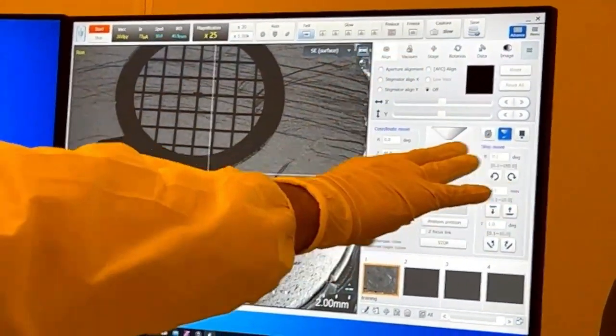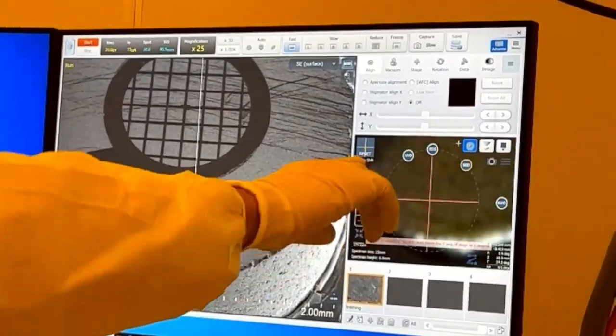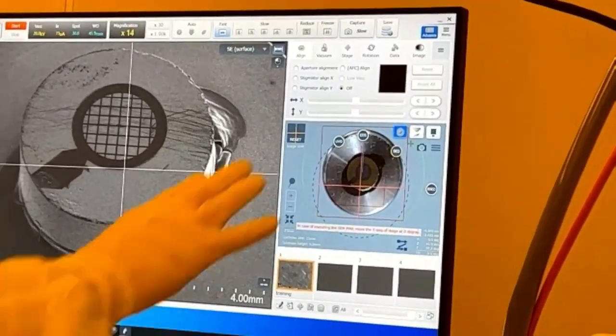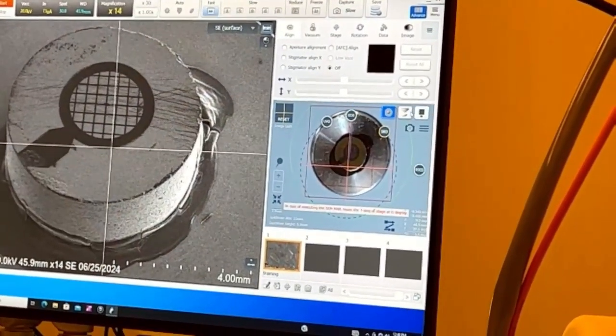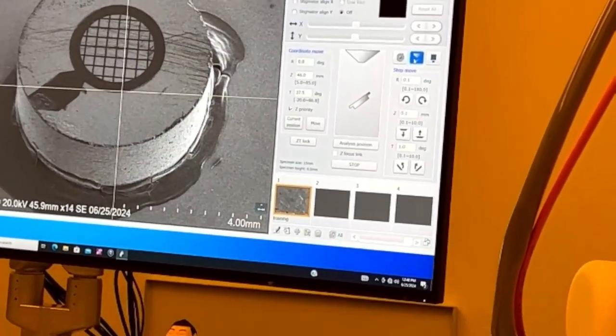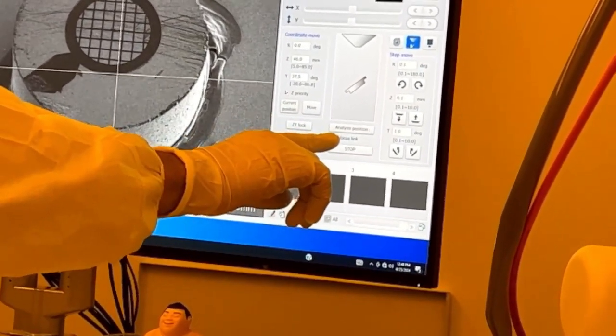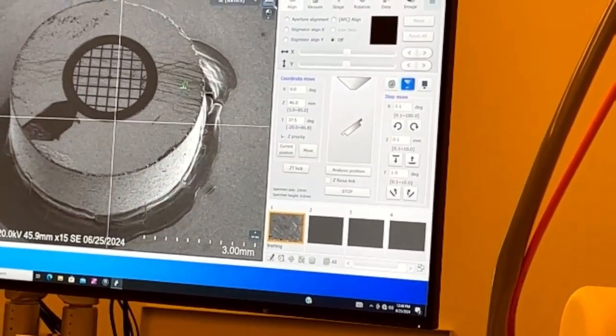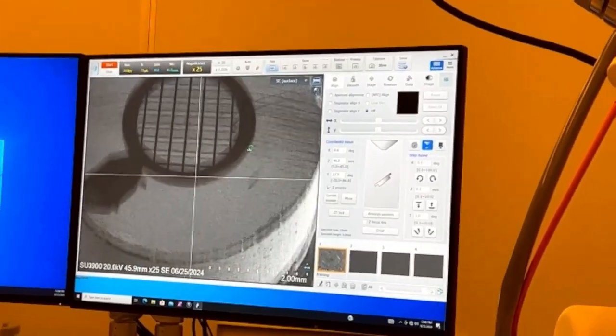So that is next to, so this is our map. And then the map doesn't tilt, right? But this is the easiest way to tilt and change Z. So like I said, if we had focus link and then rotate, I'm going to show you the easiest way to rotate.